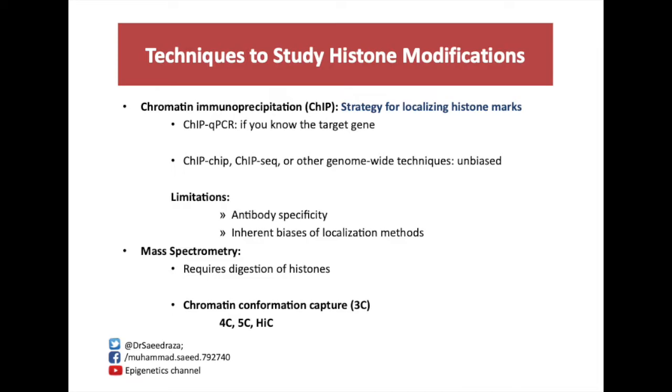Okay, students, after having some basic information about techniques that could be used to determine chromatin structure and function, let us discuss in a little bit more detail the chromatin immunoprecipitation assay and the further downstream reactions which could be possible using this technique.